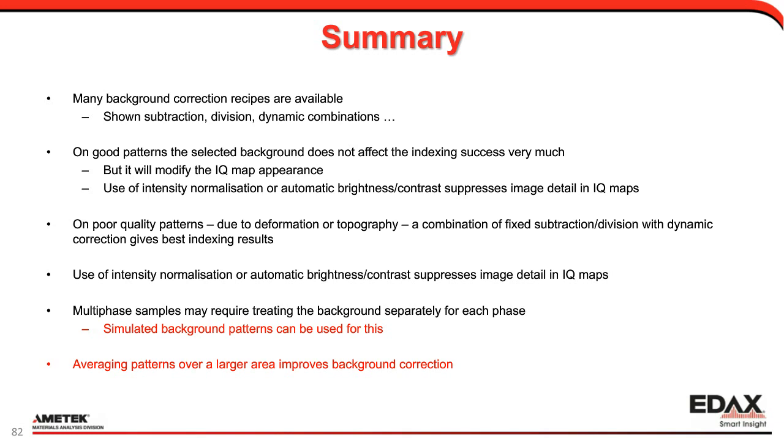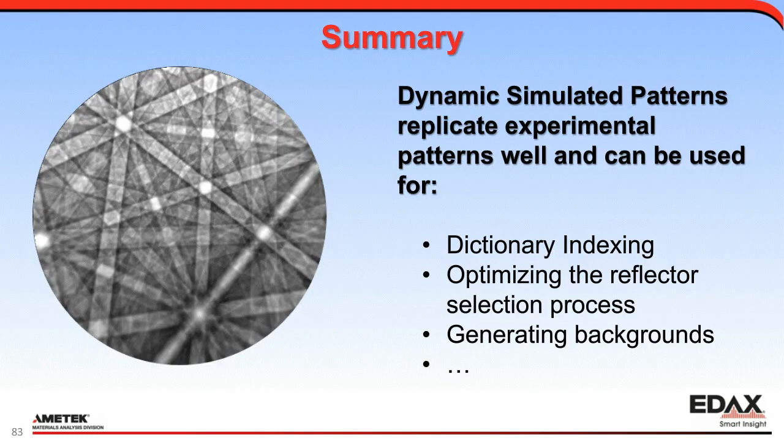Hopefully what I've shown you is that dictionary indexing shows some promising approaches for the future for improving our indexing of some of our more difficult samples. Even for standard indexing, we can optimize the reflector selection process. We can use it to generate backgrounds.